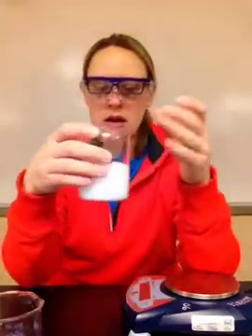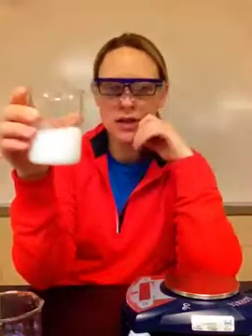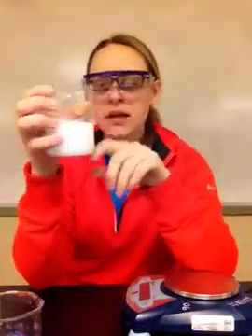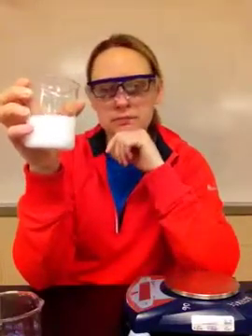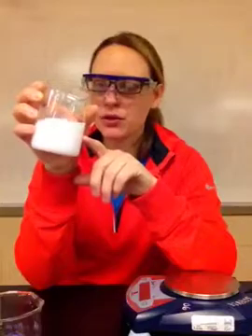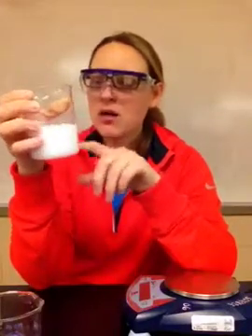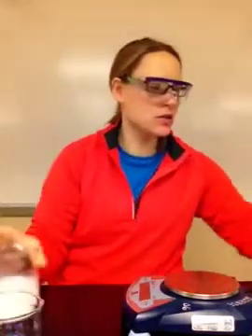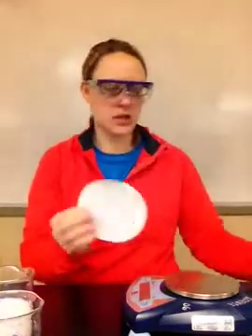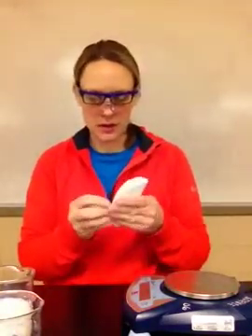Okay? So here I see, oh, that turned white. It's cloudy. That must mean that there is a solid that's produced here. Okay? So this is what I want to end up being 2 grams. Now I don't want all the liquids. I just want the solids. So if you think back to that copper lab that we just did, we are going to filter them out.